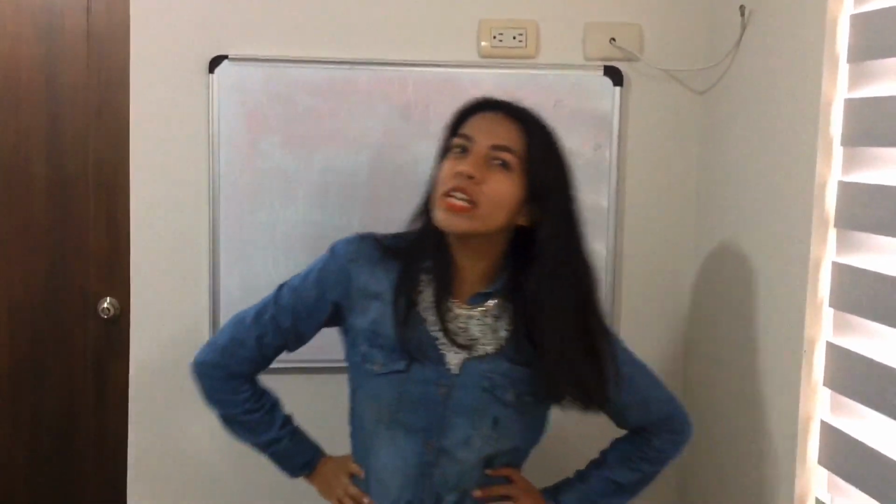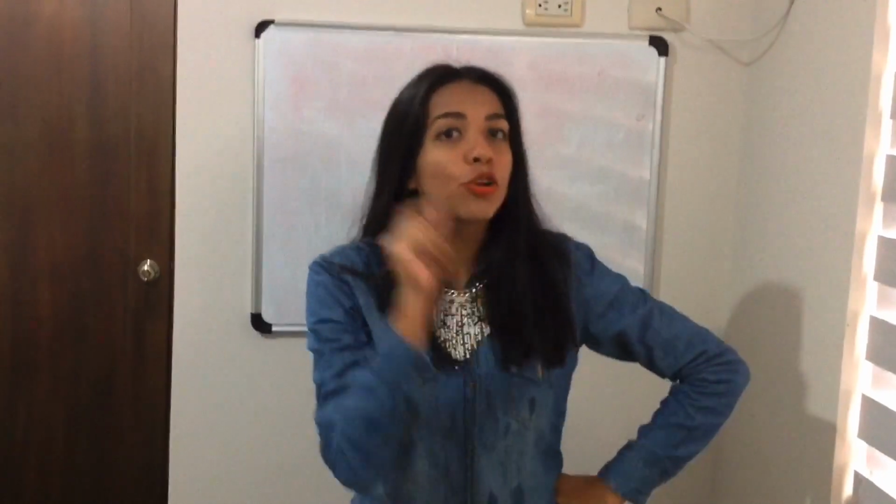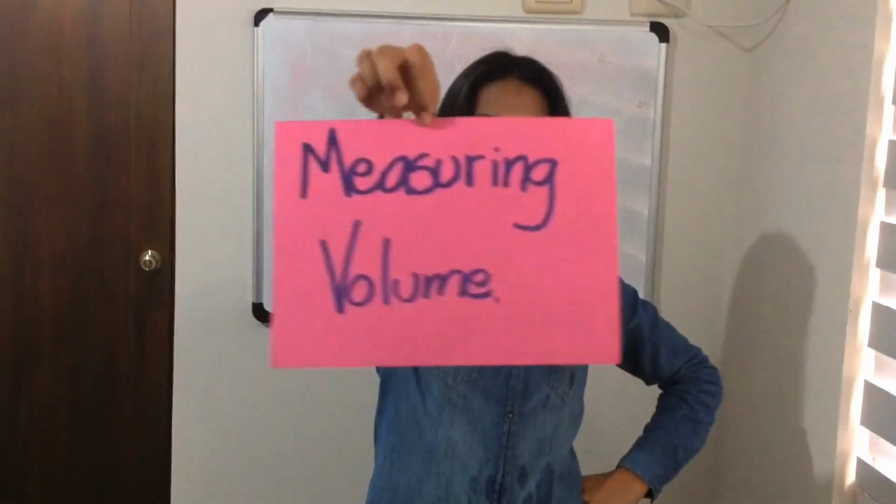On last class, we studied how to measure matter, and we know that we measure matter by measuring the two properties, mass and volume. We already learned last class about how to measure mass, and today we are going to be studying how to measure volume.